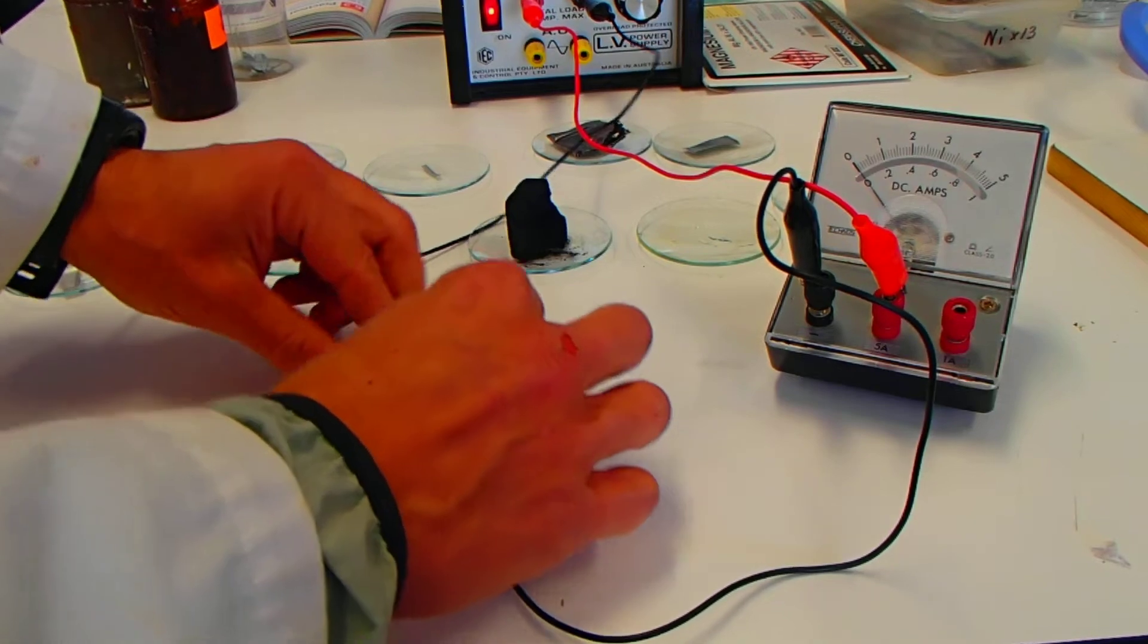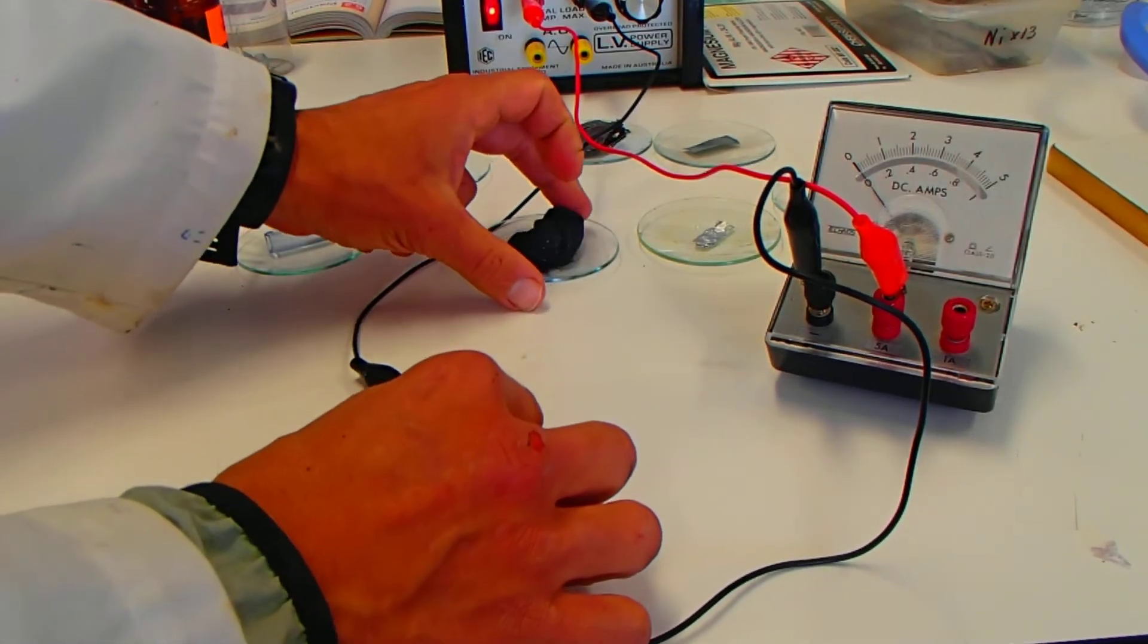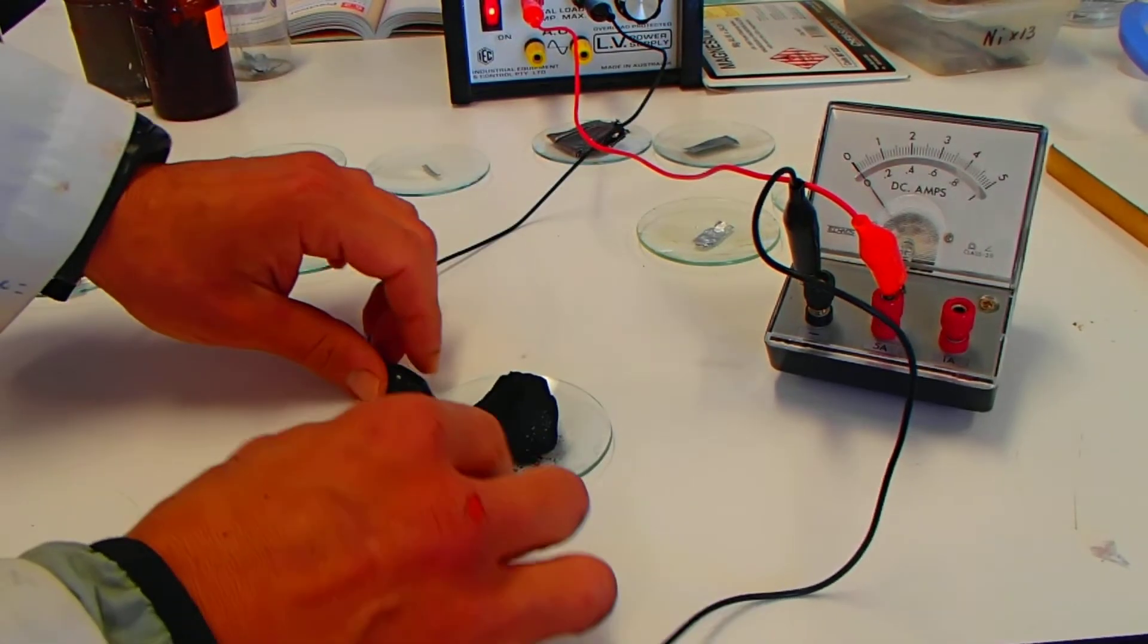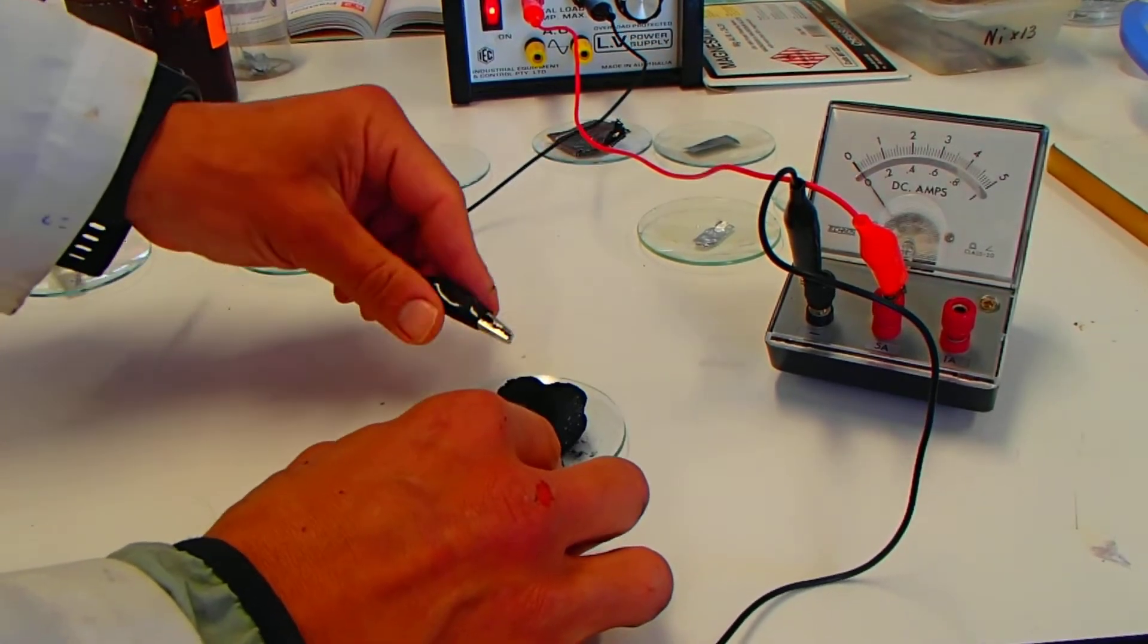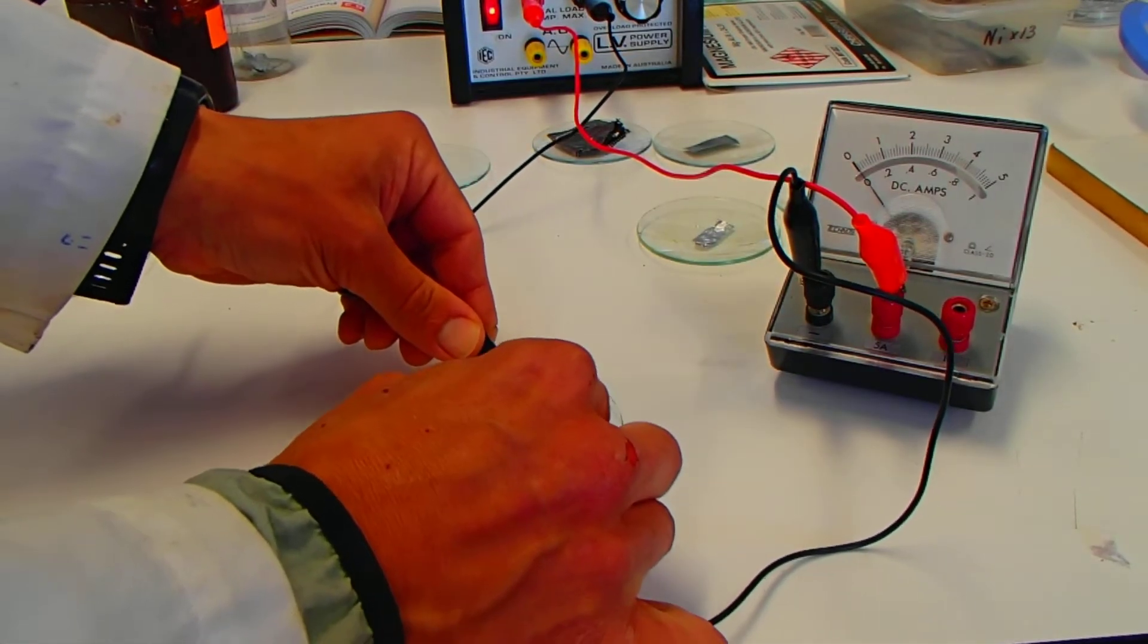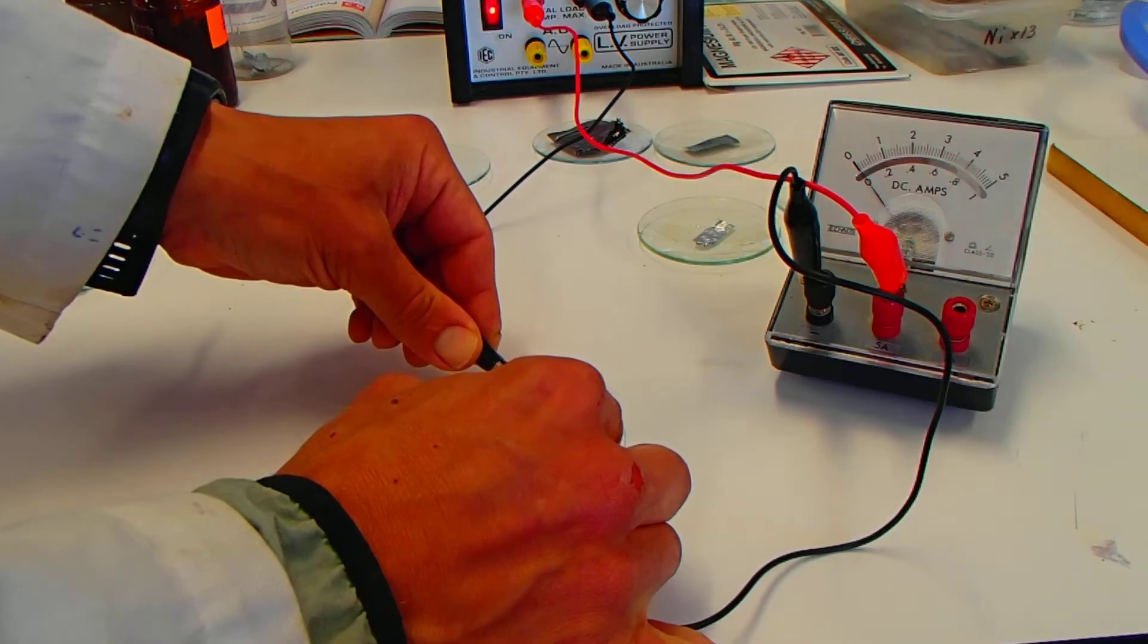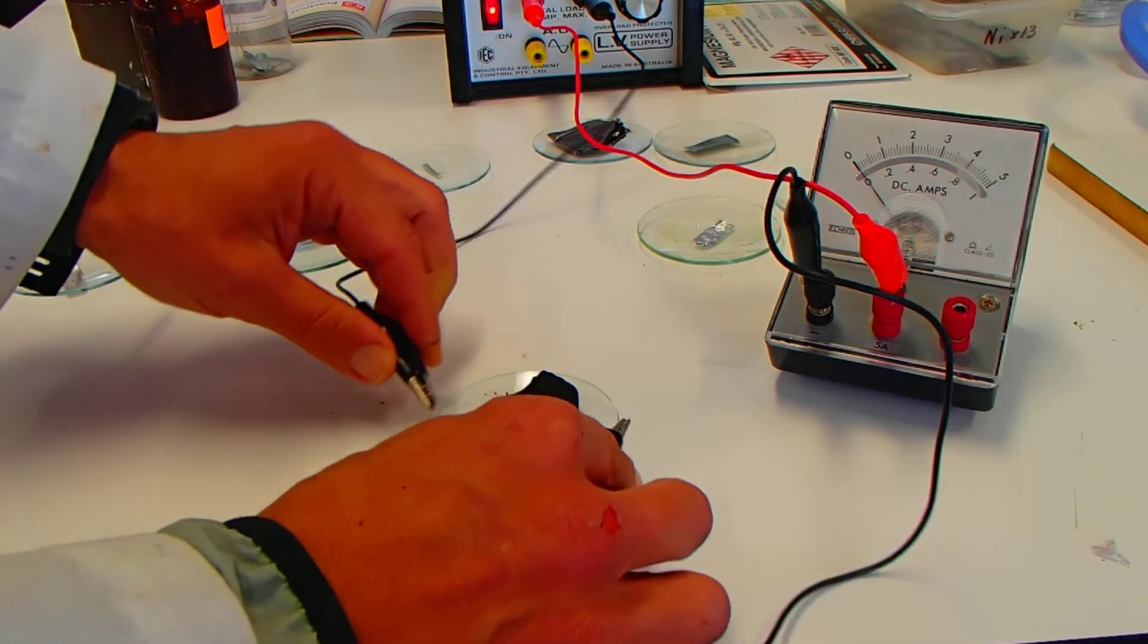Alright, moving on to carbon now. Let's have a look. Carbon is the grubby one. Of course, I'll try and get the clips on there. Clips on there. And nope, nothing there for the carbon. So no current being passed through the carbon.